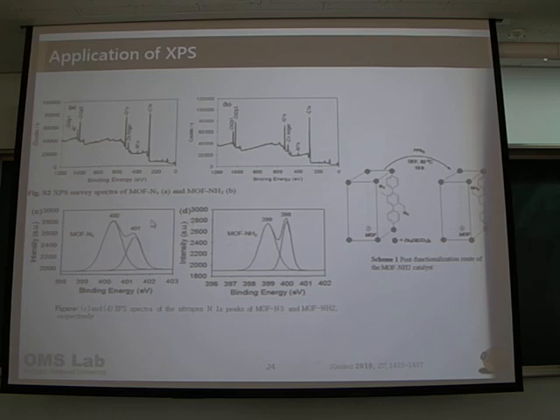The peak shape and intensity are different, but the more important thing is that they show that the amine is at 399 and 398. They give the reference. So if we write a paper, we should give the reference for our peaks. I mean, this amine is okay.